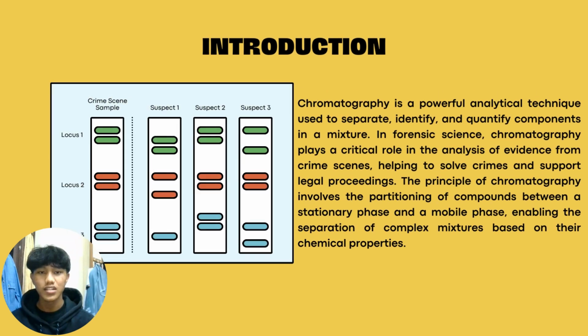Assalamualaikum and hi everyone. Today we are going to explain the crucial role of chromatography in forensic science. Chromatography is a powerful analytical technique used to separate, identify and quantify components in a mixture. In forensic science, chromatography plays a critical role in the analysis of evidence from crime scenes, helping to solve crimes and support legal proceedings. The principle of chromatography involves the partitioning of compounds between a stationary phase and a mobile phase, enabling the separation of a mixture based on their chemical properties.